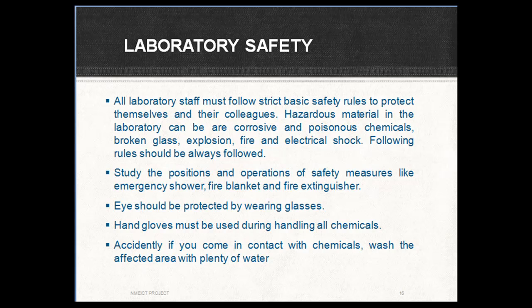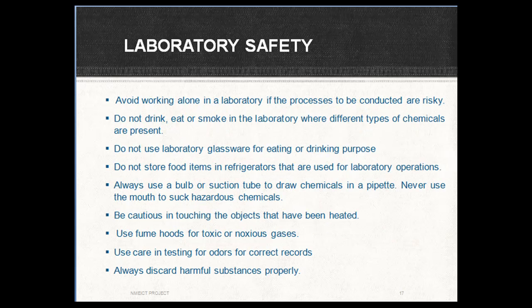Avoid working alone in a laboratory if the process to be conducted is risky. Do not drink, eat or smoke in the laboratory. Do not use laboratory glassware for eating or drinking purposes. Do not store food items in refrigerators that are used for laboratory operations.